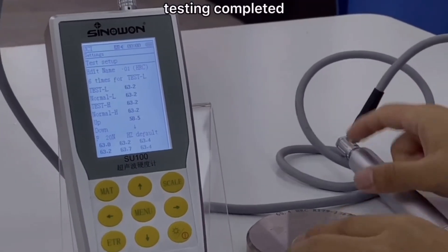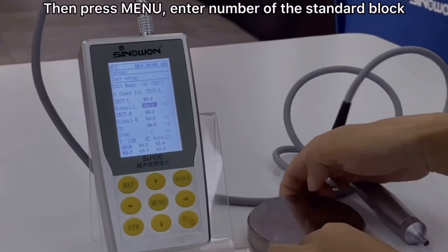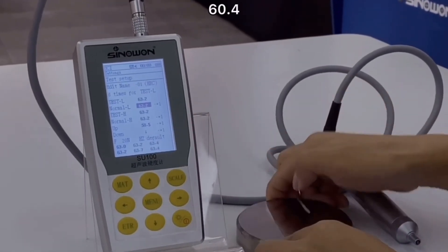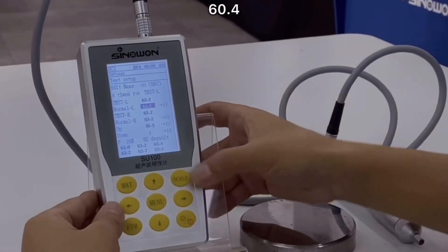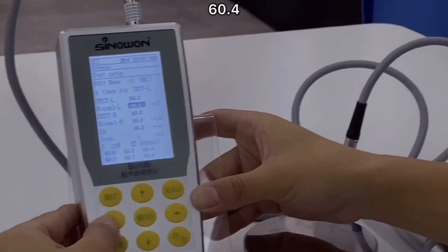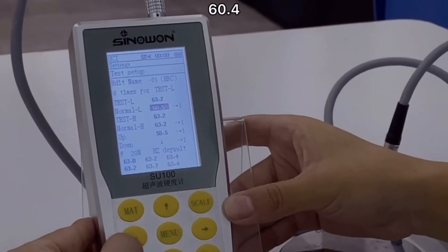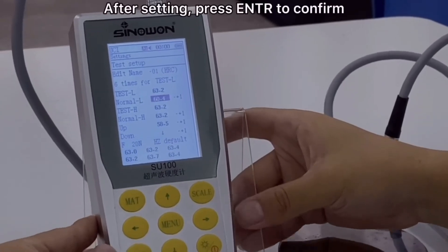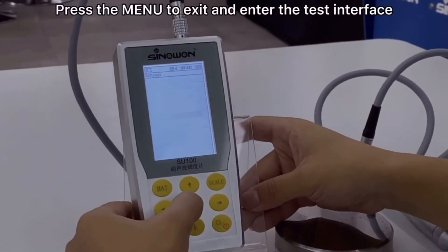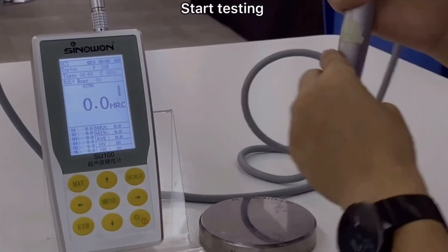Testing completed. Then press menu and enter the number of the standard block. After setting, press ENTR to confirm, then press menu to exit and enter the test interface. Start testing.